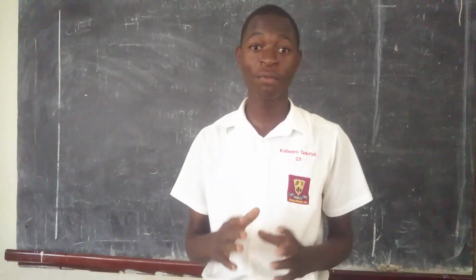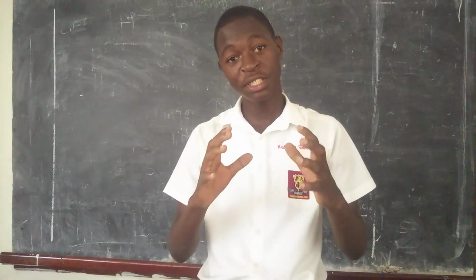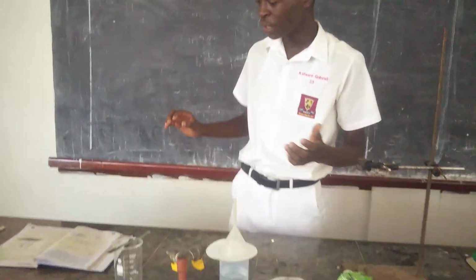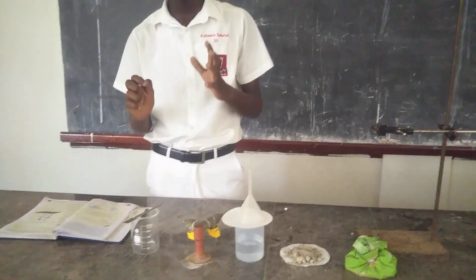So today I've just come here to share with you a little experiment of separating mixtures. Today I'll be separating the mixture of water with sand, after mixing them. So our experiment name today will be separating a mixture of water and sand.